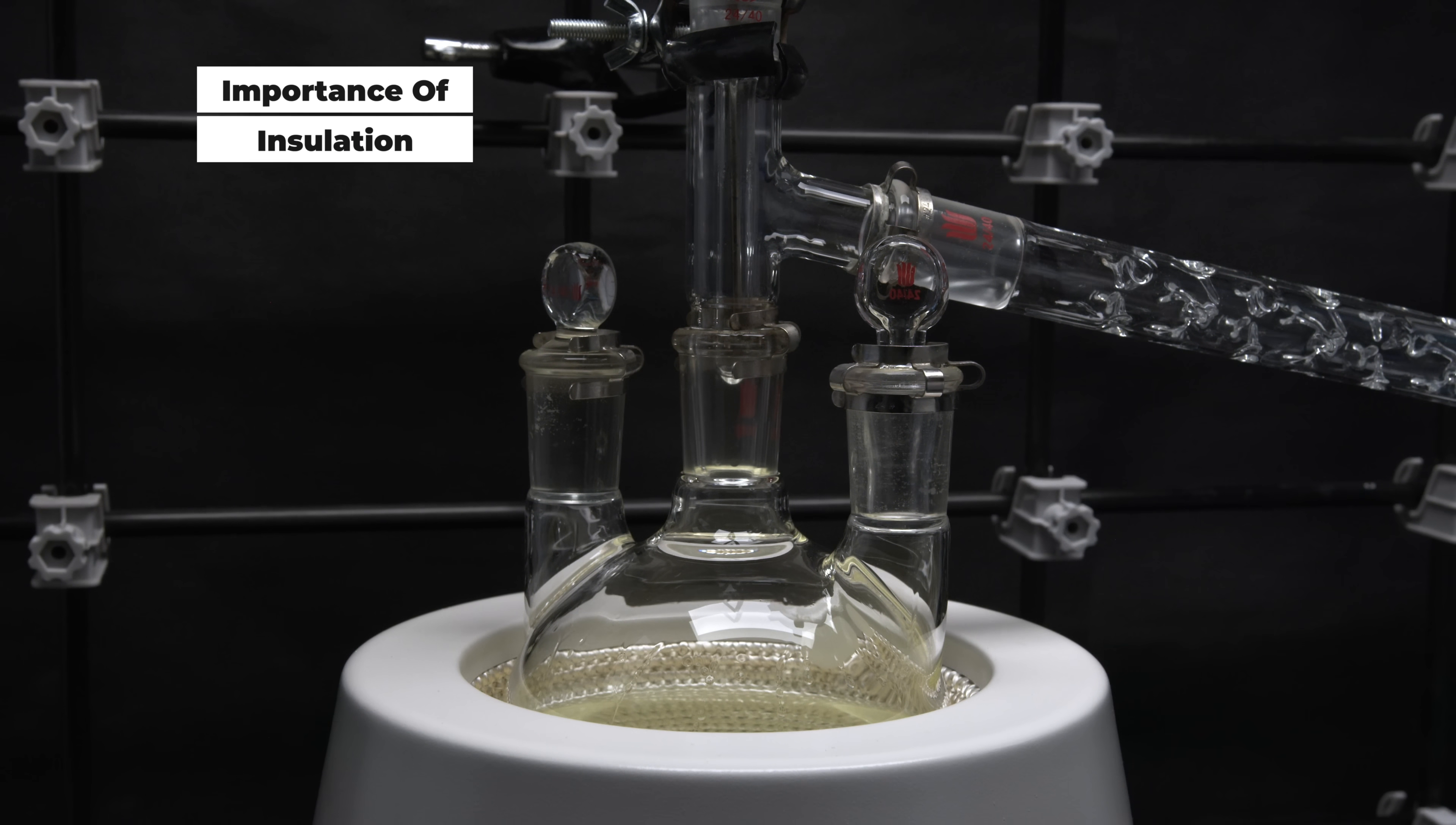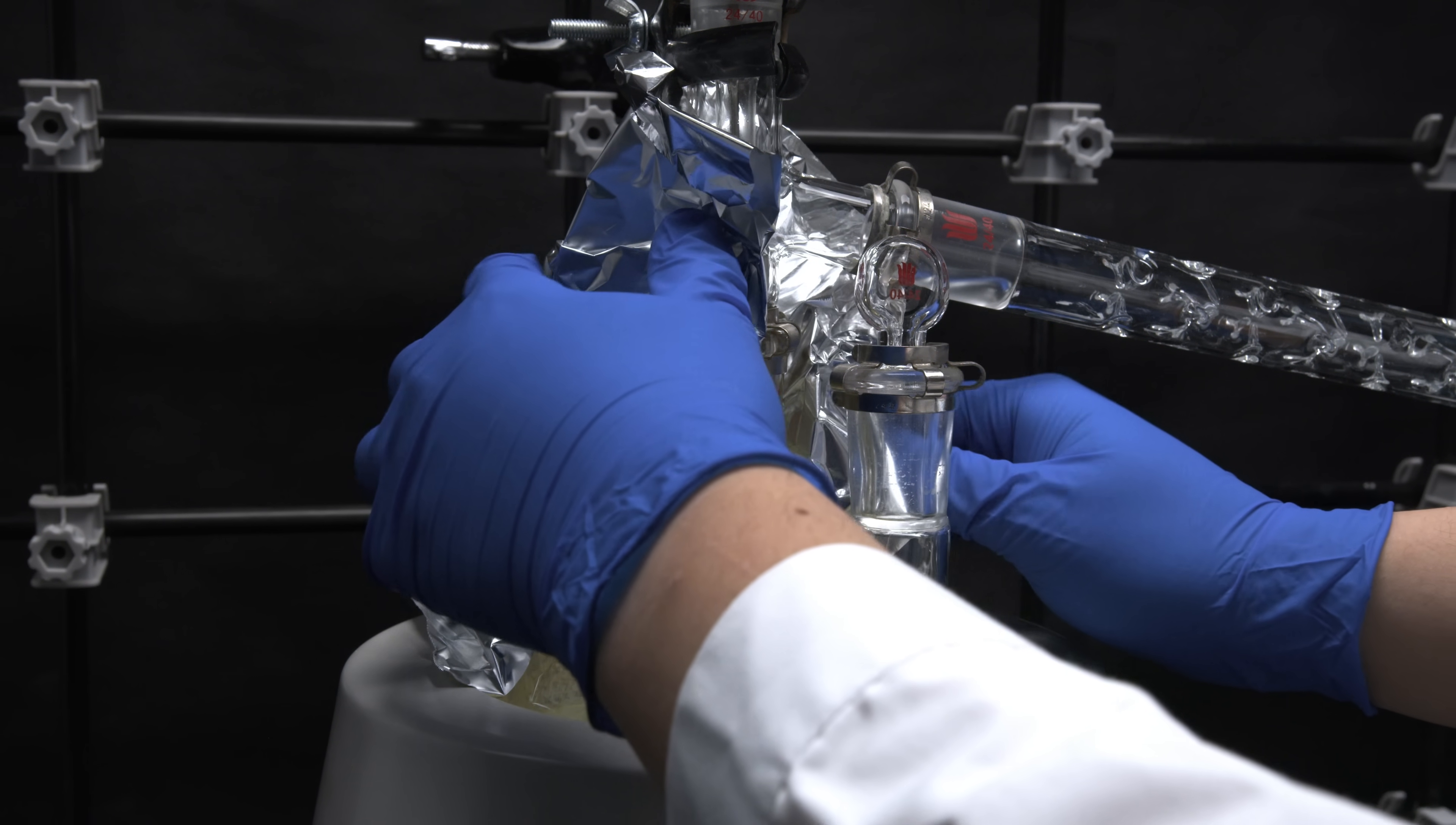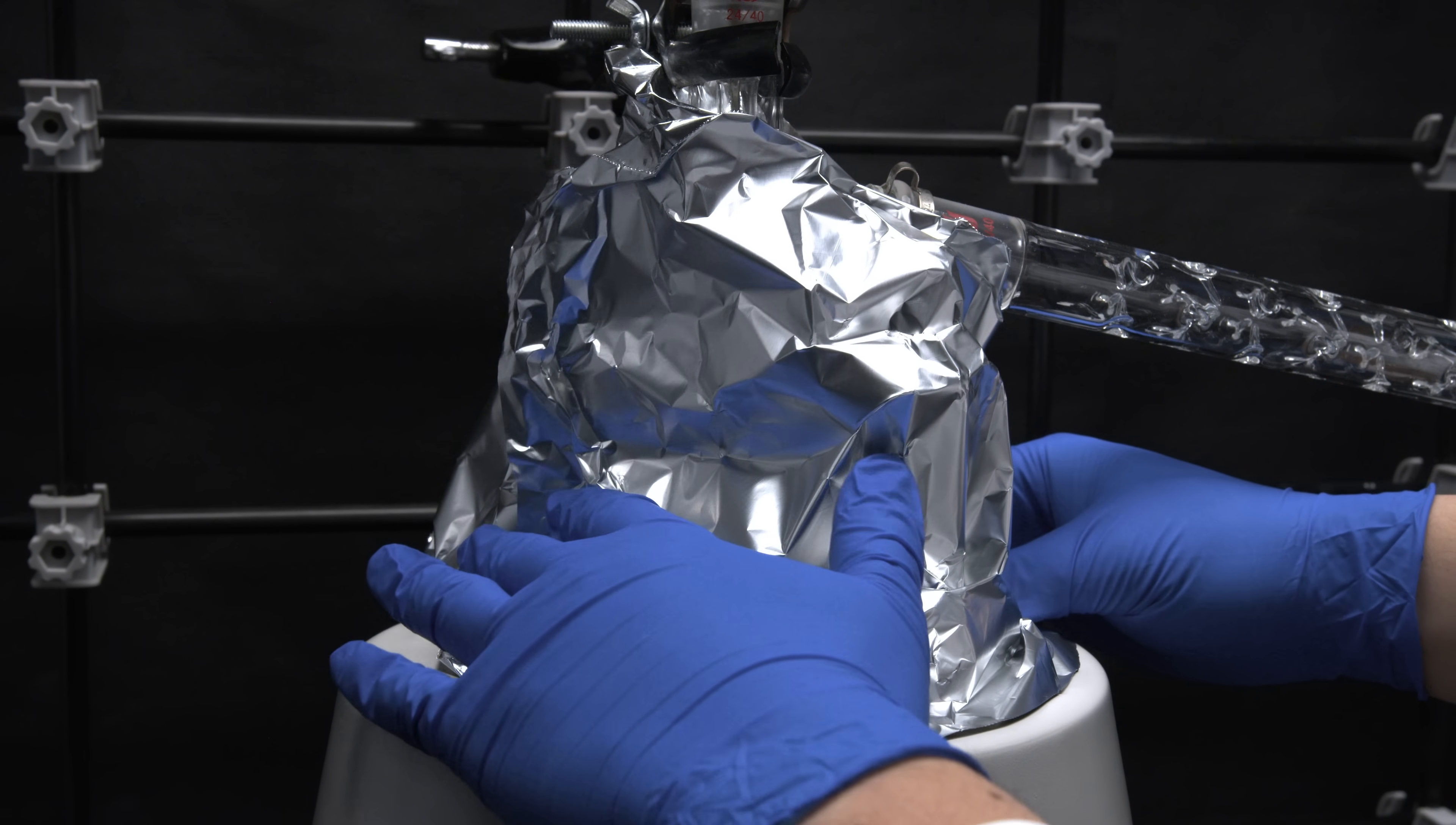It is also mandatory to insulate the distillation setup with aluminum foil, since there is a constant heat loss to the surroundings. And the vapor will struggle to reach the distillation head without the help of insulation. The solution will also potentially build up more superheated points due to the steep temperature gradient, and a flash boil might occur as well, which is really bad.